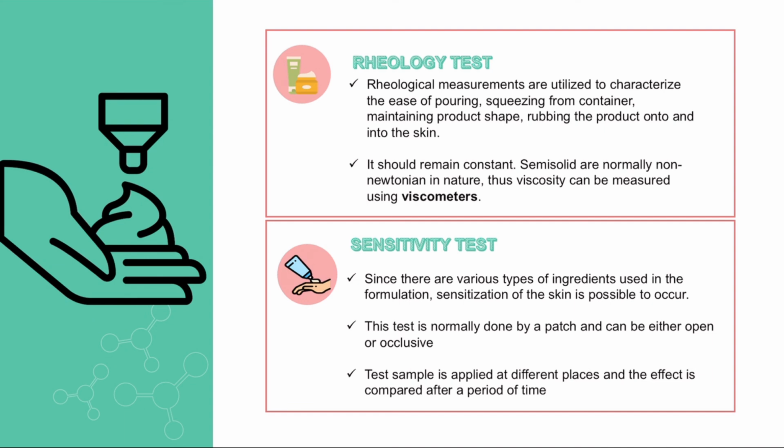The test sample is applied along with a standard market product at different places, and the effect is compared after a period of time.